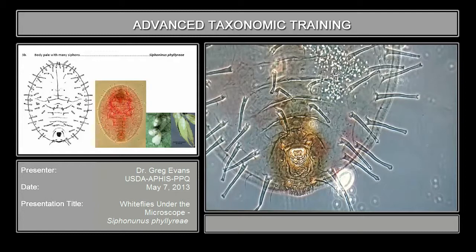This is the caudal end — the caudal cd and the vasiform orifice. You see that the operculum is very small and it only covers less than half of the orifice. But in this case, the siphons alone are enough to place it to genus.